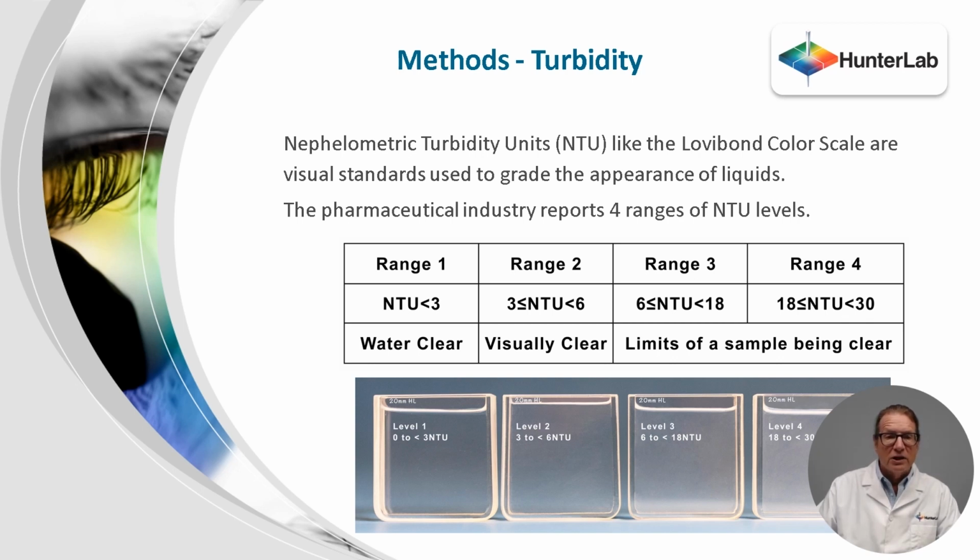You can look at the poster to see a neutral representation of the turbidity levels or ranges that I just described. These levels are constant for any hue: red, yellow, blue, of course neutral. If we initially report the turbidity, it will allow the recipient of a certificate of analysis to know the true clarity associated with the sample color.